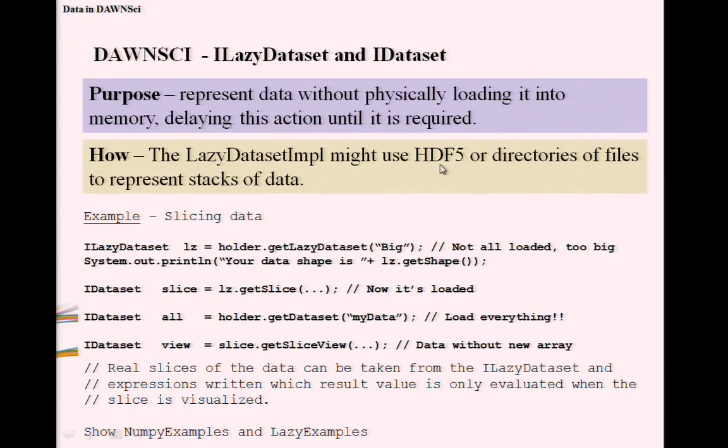We like to have our data in big stacks, and then we use attributes within HDF5 which describe what the data is. We have sub-data sets called axes, which for a given dimension give you a dimensionality. So for instance, if you have 10,000 images and they're all taken at a different time, you'll have another data set, an axis data set, which will be the time that each of those images was taken. And each dimension will have multiple axes.